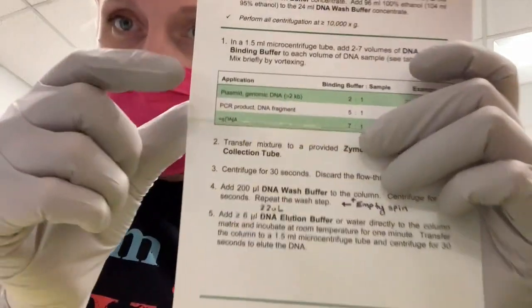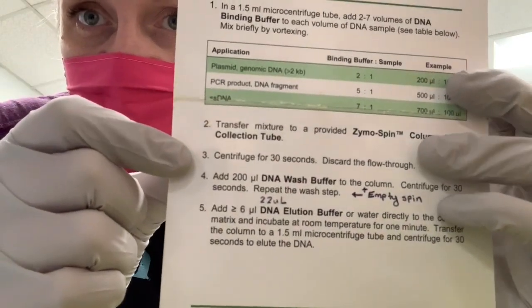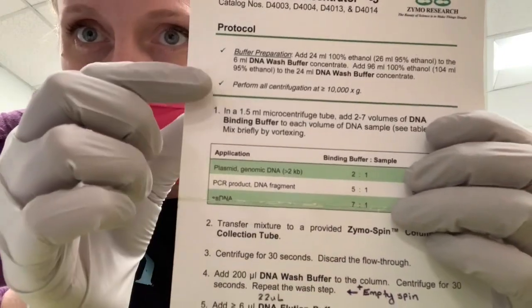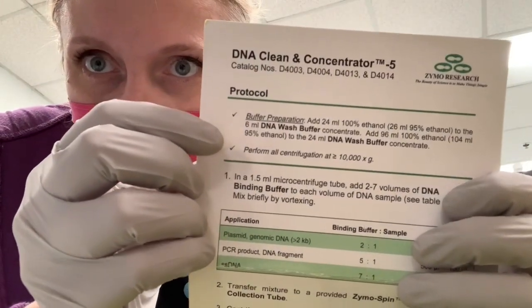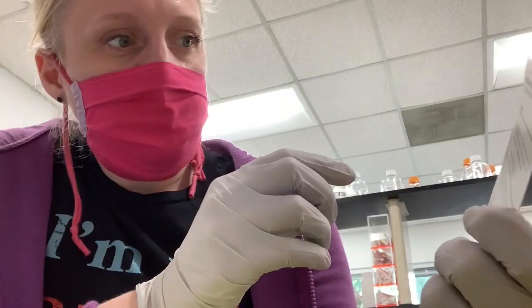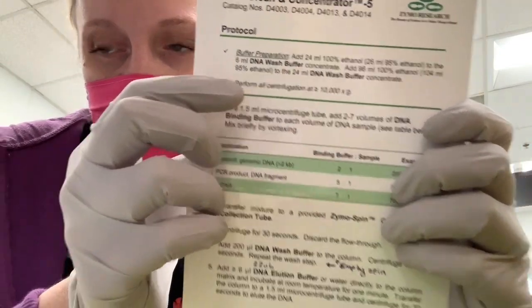So we've now gotten through the first step and the second step on this. The next is to centrifuge for 30 seconds and discard the flow through. And if you see up here at the beginning somewhere, I think it says perform all centrifugation at greater than or equal to 10,000 Gs. So I'm going to take you and my samples over to the centrifuge.